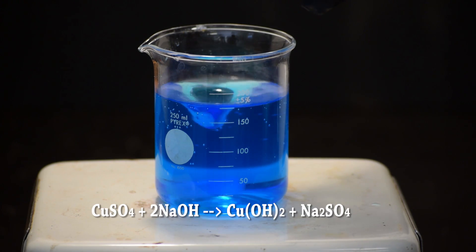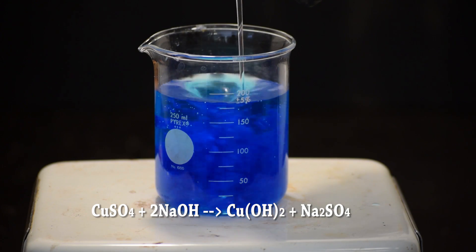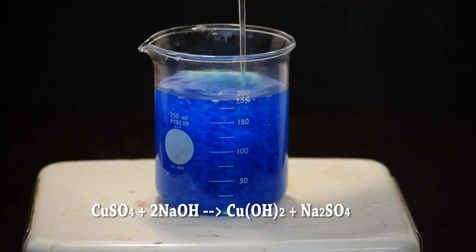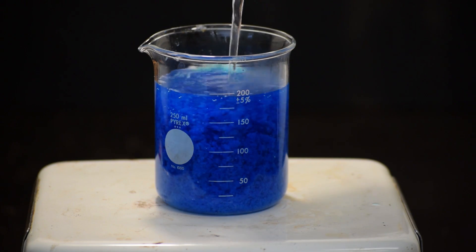When ready, add the sodium hydroxide solution to the copper sulfate. A dark blue precipitate of copper hydroxide will form.